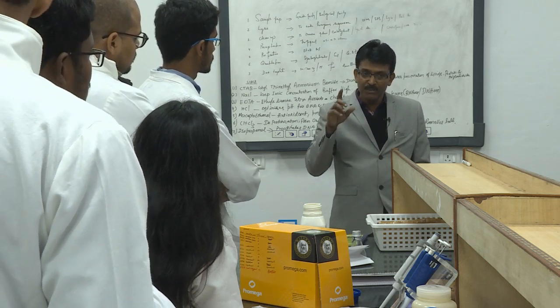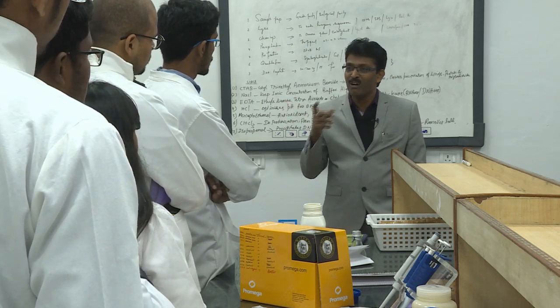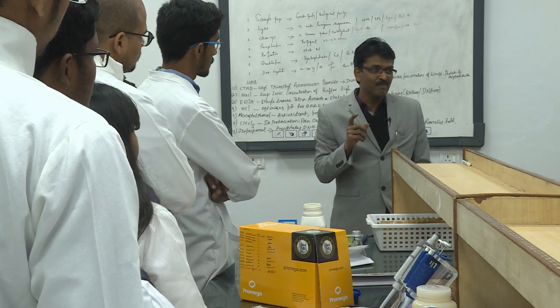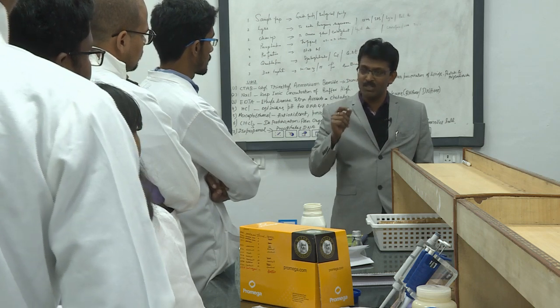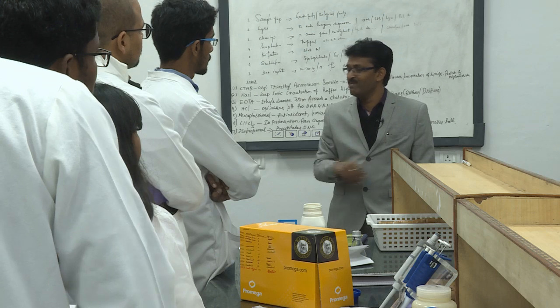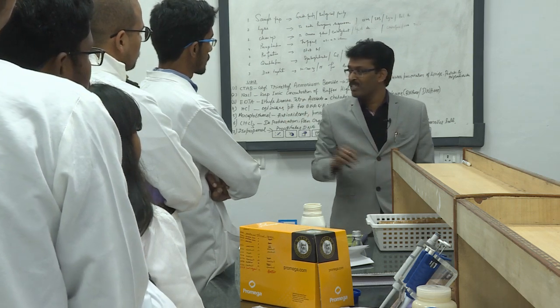So, if you read the Biolog identification scheme, they always say you preserve the original culture. That is very, very important. Original culture means the one which is isolated the first time from the environment. Environment can be anything. It may be agricultural environment or whatever, soil or irrigation water, whatever it is.